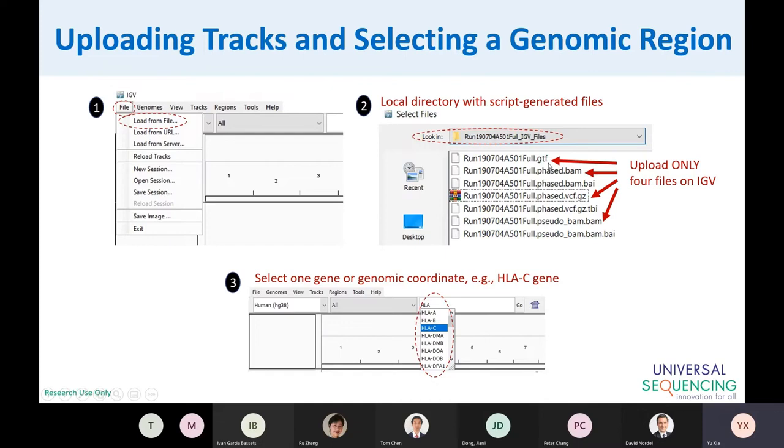So that region contained 3 SNVs, located here, and then located here. And the phasing result is strongly linked to breast cancer. So we would like to have that phasing result.